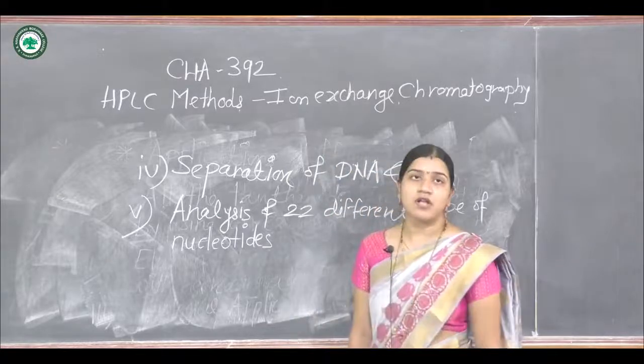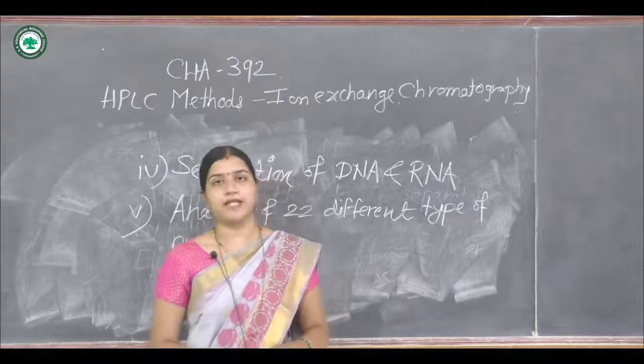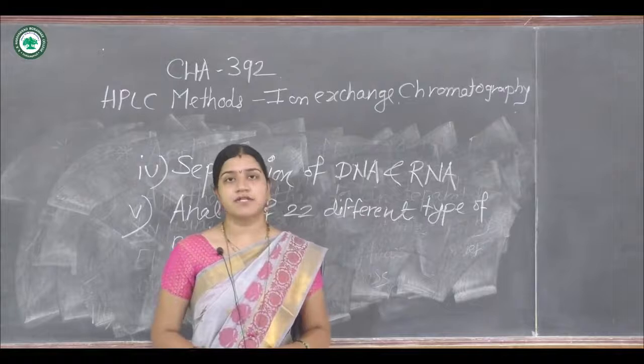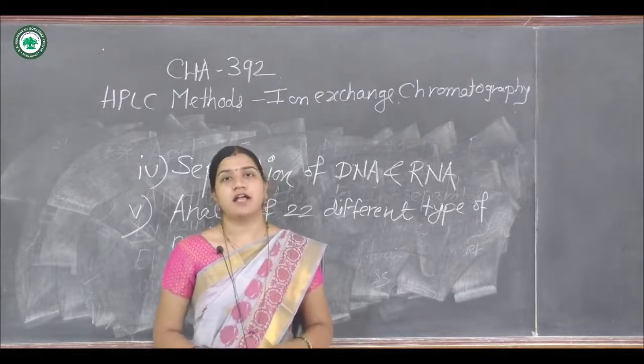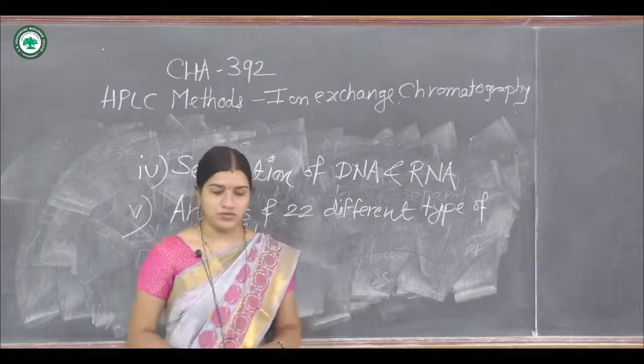So this is all about the different applications of ion exchange chromatography. The main application is the separation of lanthanides, another is the separation of DNA and RNA, and another is the analysis of 22 different types of nucleotides.